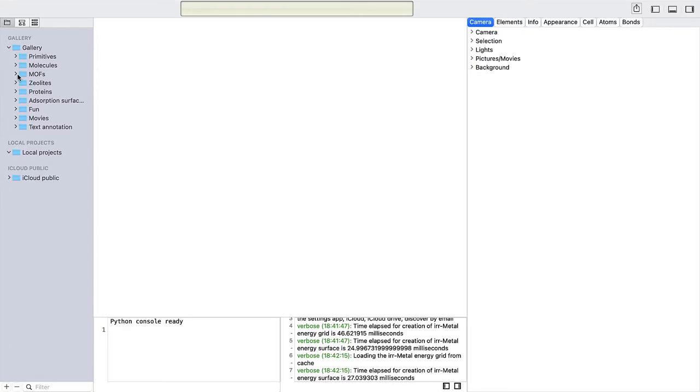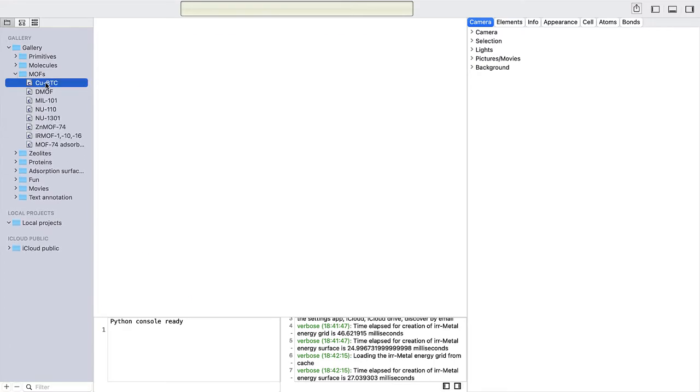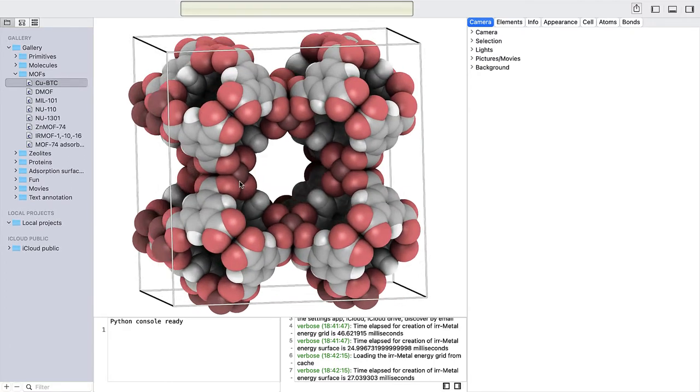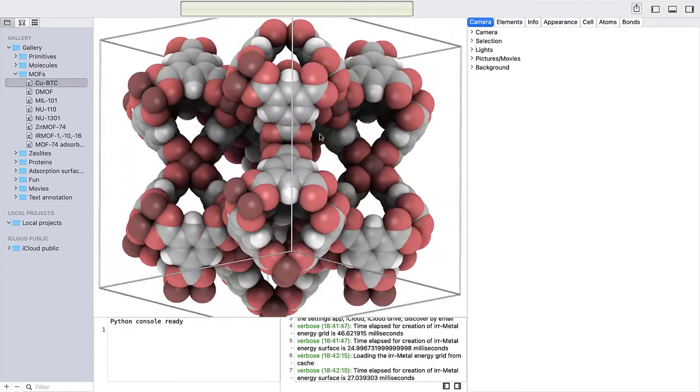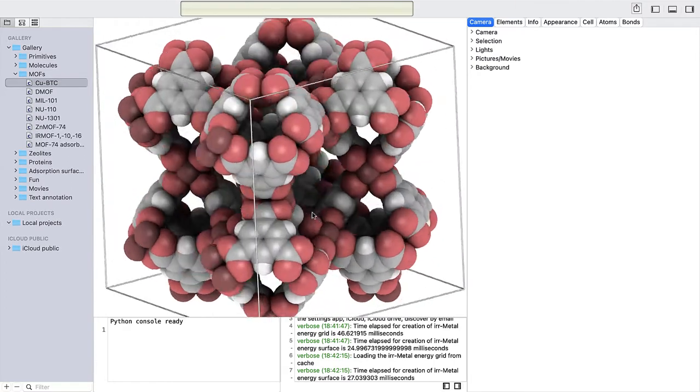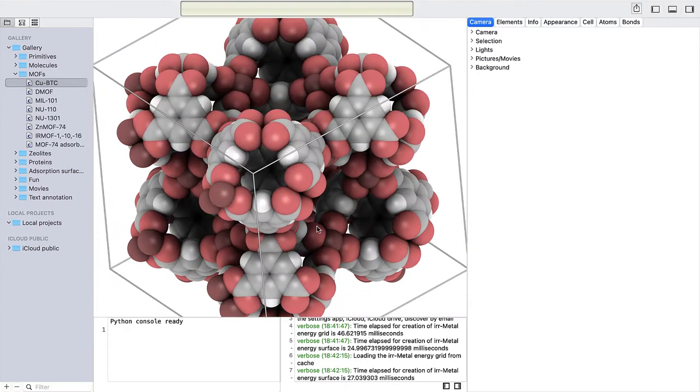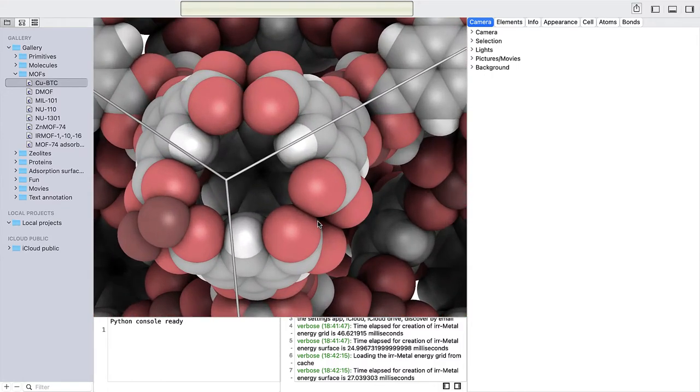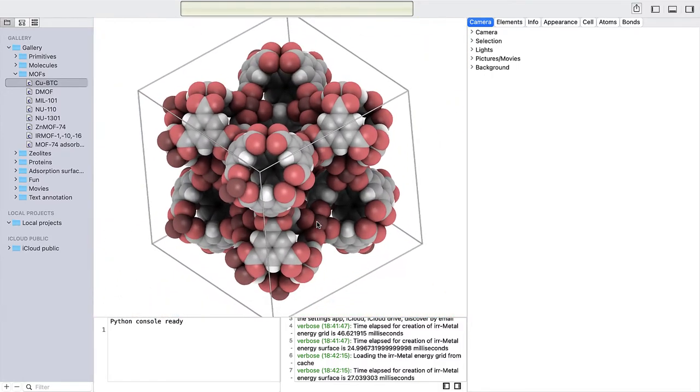Click on a project in the Gallery and the selected project will be shown in the render view. You can now inspect the structure by changing the camera viewpoint with a mouse and by zooming in and out.